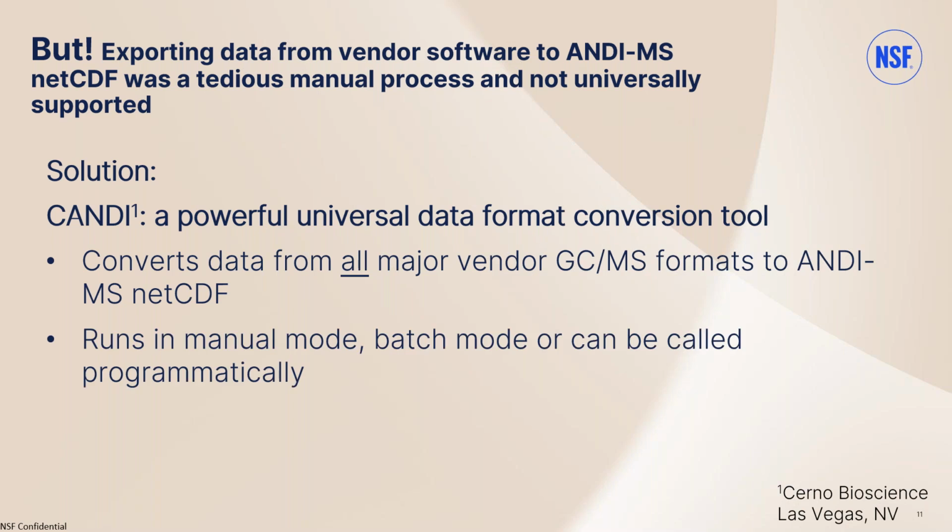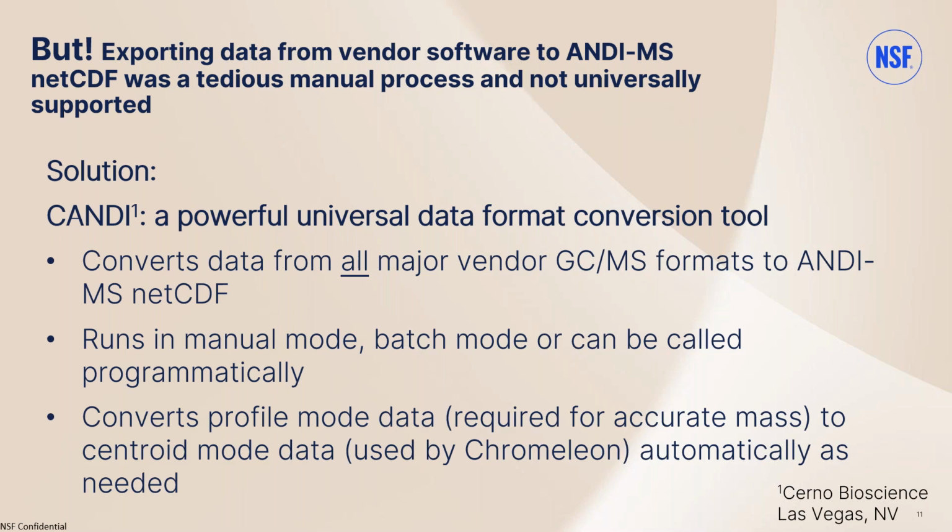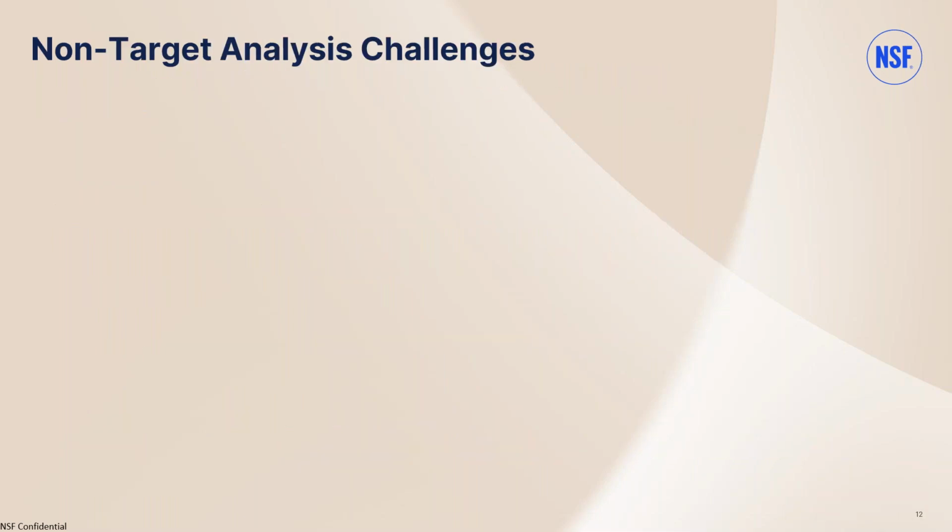It has some good features that make it convenient for lab use. And it also converts profile mode data back to centroid mode data. Profile mode data, as you'll see later on, was important for the non-target analysis, but target analysis is much more comfortable in centroid mode. So we wanted it to be able to transform the data back to centroid mode for the target analysis.